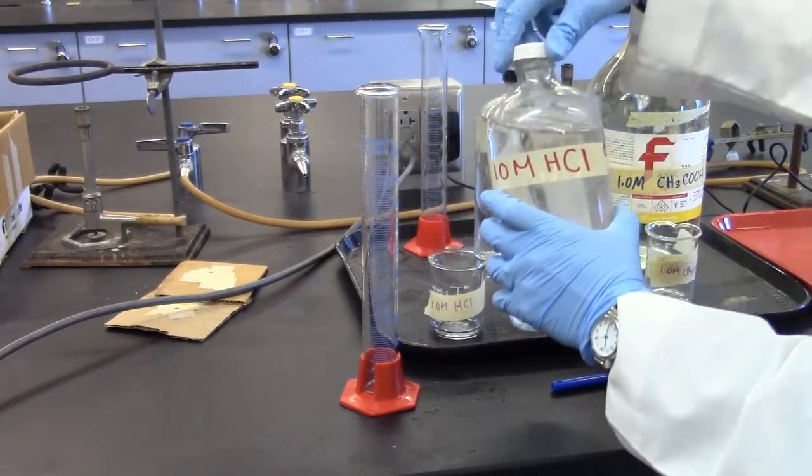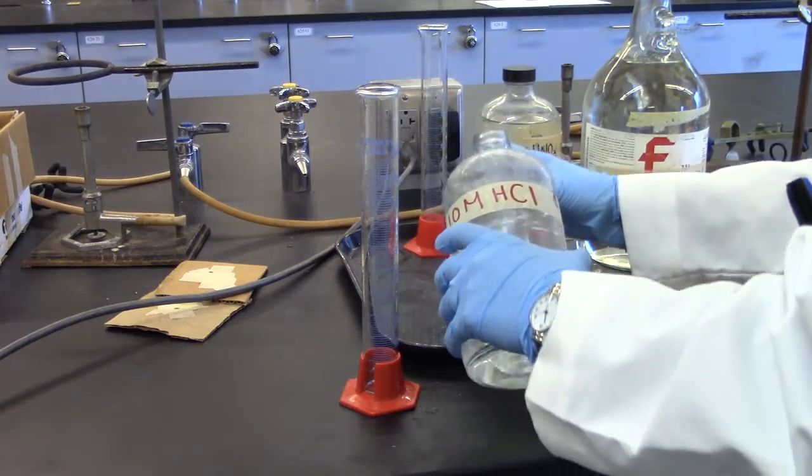In a graduated cylinder, measure out 100 milliliters of one molar hydrochloric acid.